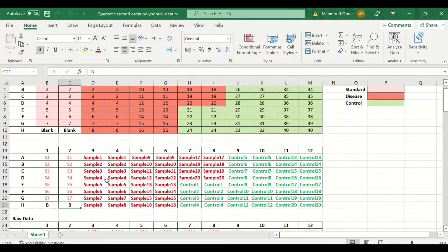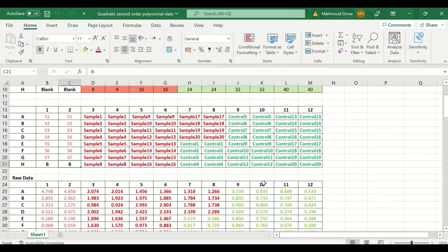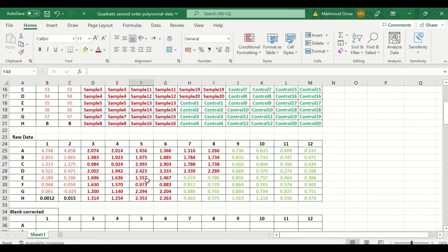The second section shows the labeling of the samples: the first two columns for the standard samples and the blank, red coded text for the diseased samples, and green for the control unknown samples. In the next section, the raw data was inserted for all the samples.